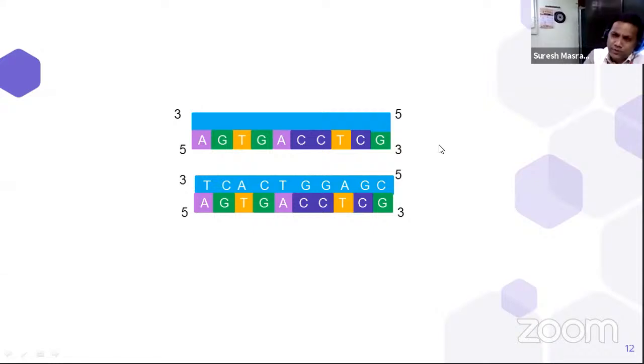During the course of replication, we know what the attaching nucleotides are because we stop the replication at different places. In the electrophoresis gel, when this gel is subjected to radiography, we place the X-ray film over the gel and place it in the X-ray cassette.